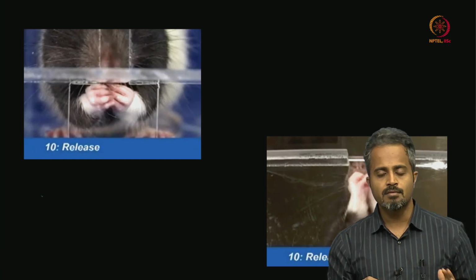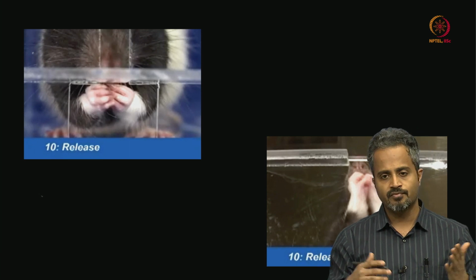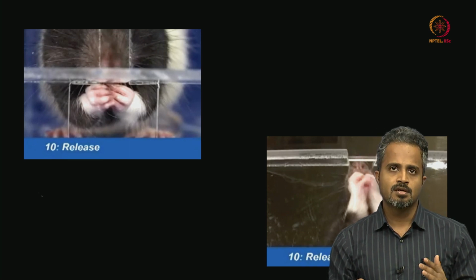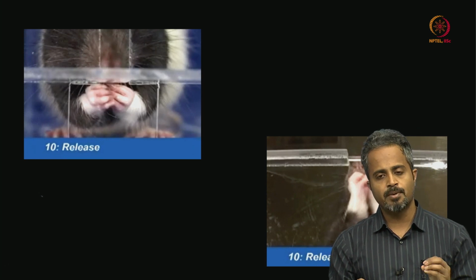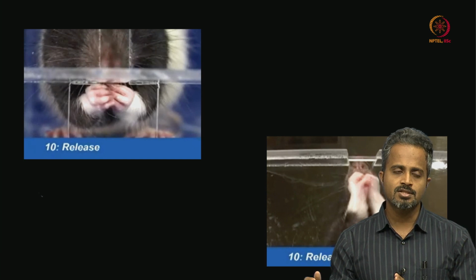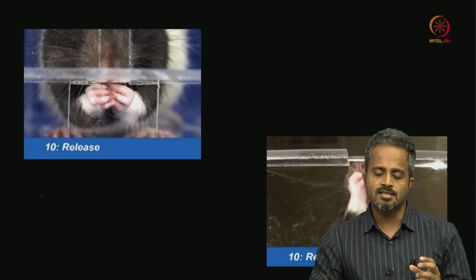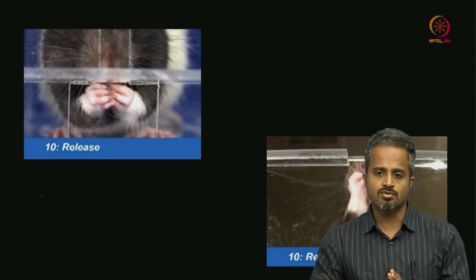For that matter, any behavioral test you can break down into 10 different steps or 15 different steps, as long as there is consistency in it, because you are going to do around 30 to 40 trials of these pellet retrievals every day for almost 7 days. Alright, so there is a good amount of video data that you can analyze and see how consistent it is. That is something you need to do before you do the stroke surgery.